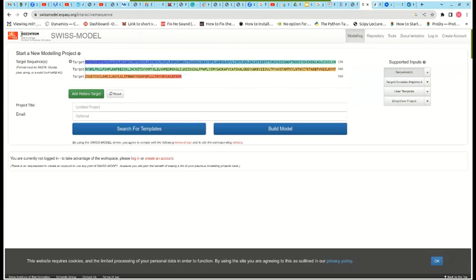So do we have this? Yes. Okay, so if you want to title the job, it's actually optional. You can title it so that by the time it brings out the results, you could put that title 17-beta HSD. If you want the results to be sent to your email, that's optional. You can put it there or leave it.